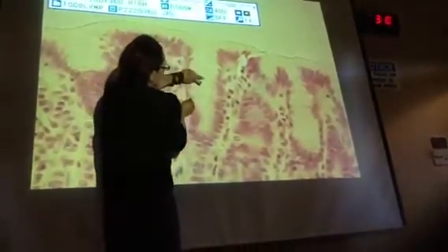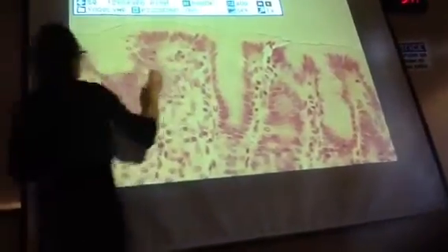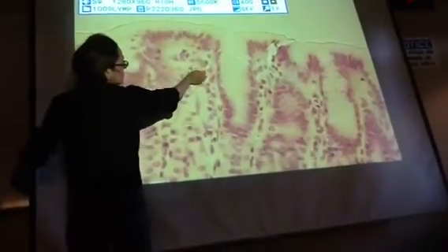So you can look at that when the lights are on. But the two edges of the apical surface of your columnar epithelial cells are just touching, and the pit's right there in the middle. So again, if you follow the nuclei, this is your basal surface.